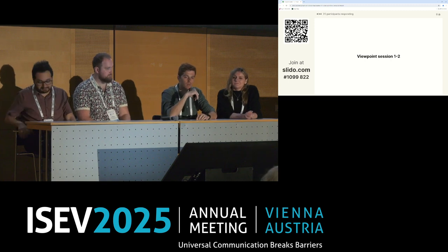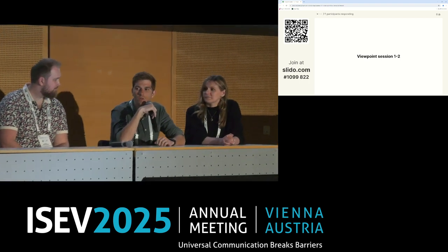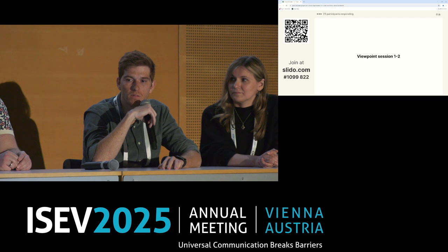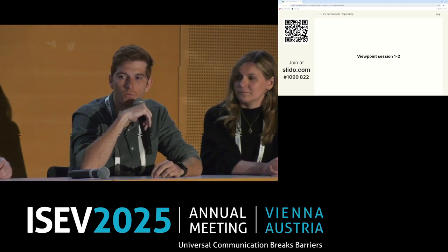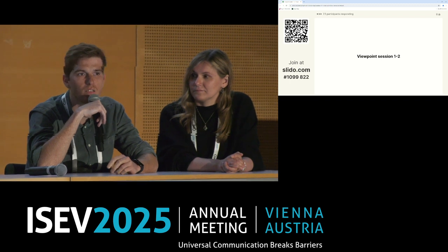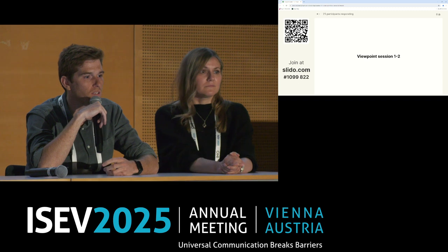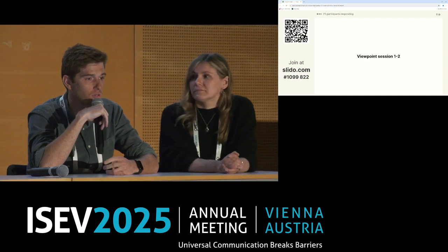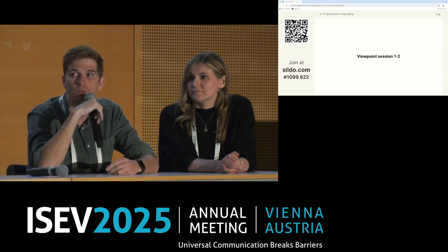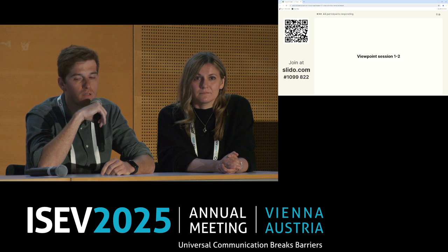So I think I will take a bit of inspiration from a lot of the talks that we heard this morning, and I will break it down into 3 main steps. The first step is really to understand why you're isolating your vesicles, because that will really assist in deciding exactly what type of isolation method you will use in the future. Like we just heard from the previous talk, it has very important decision cascades down the line. It's just a domino effect.